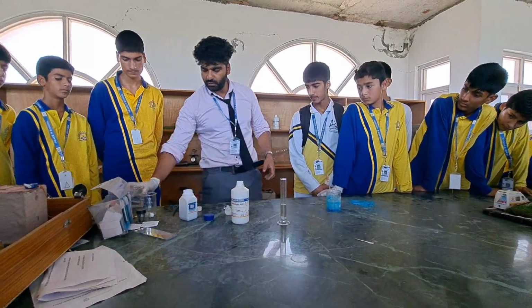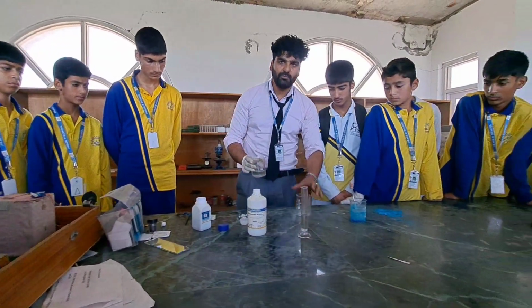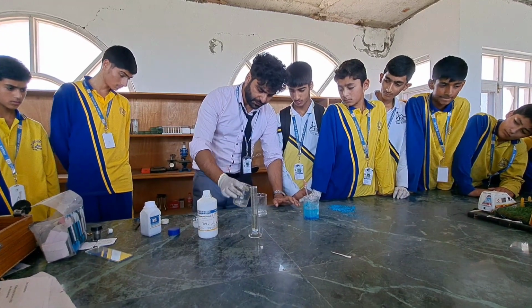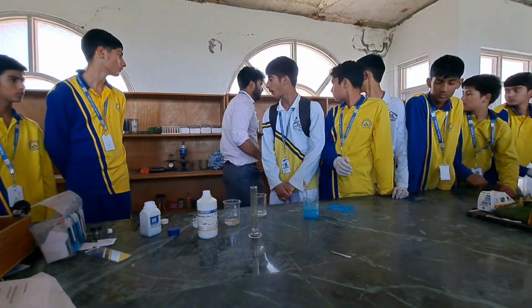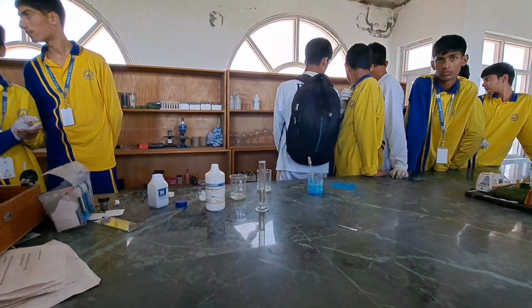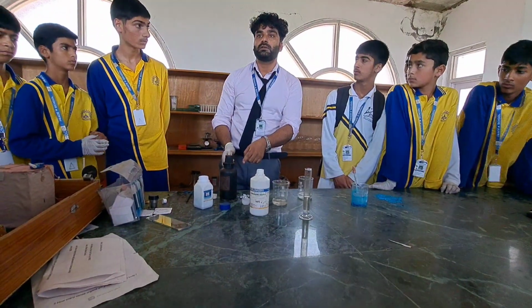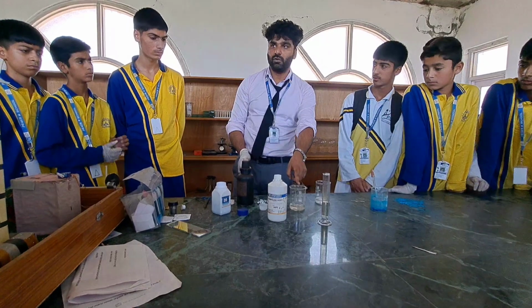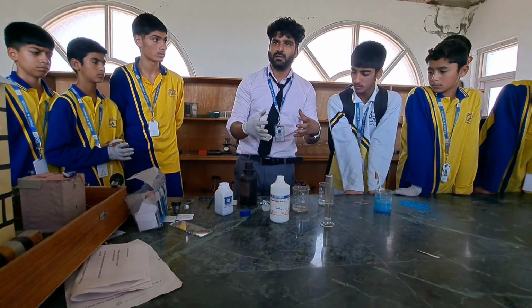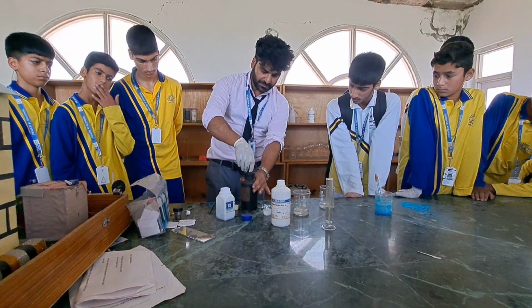For that purpose, listen, I am taking some water here in this beaker. I will make a little bit stronger acid. I am taking a little water here. And now I am taking this sulfuric acid, but this is concentrated sulfuric acid. I have taken water. I will pour a few drops of sulfuric acid into this, and I will make a different kind of dilute sulfuric acid solution. Okay, just wait for a moment. Let me open this bottle.